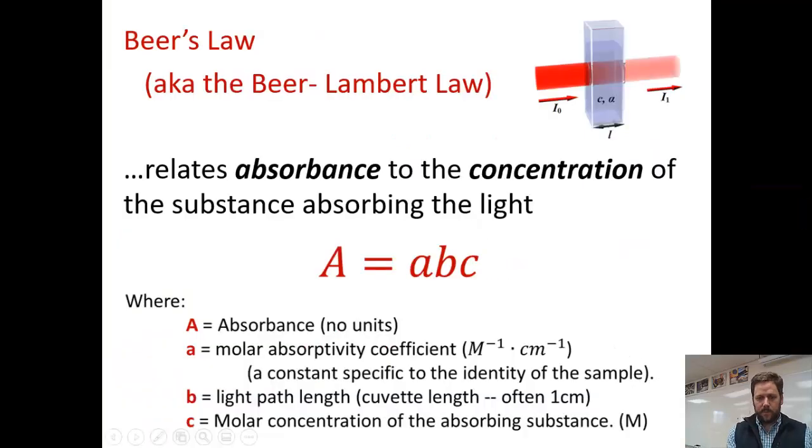Now we'll be looking at this relationship and analyzing the concentration of aspirin in a tablet.